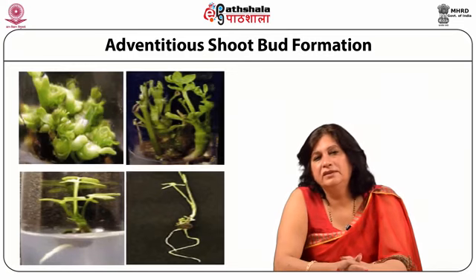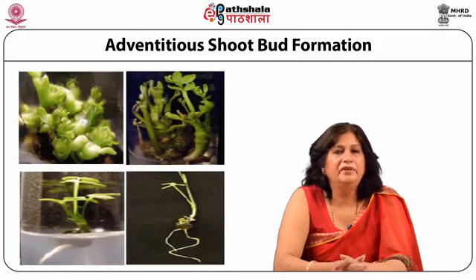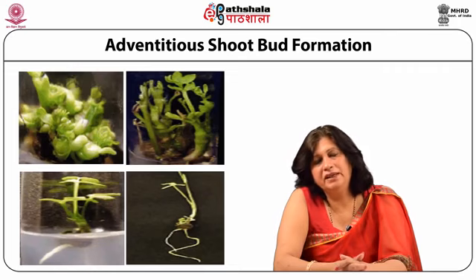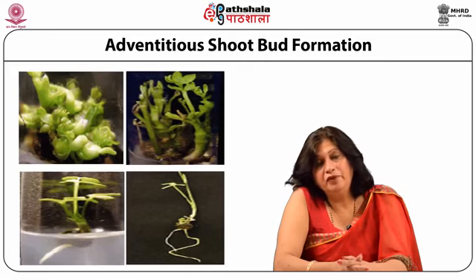The callus cells, by changing the growth regulator, can give rise to adventitious shoots. Again, these shoots arise in very large numbers. You can separate them from the callus and then transfer to media with different composition for further growth. And then individual shoot is taken for rooting and then transplanted. Again, these shoots, since they are arising from the callus, may not be uniform.